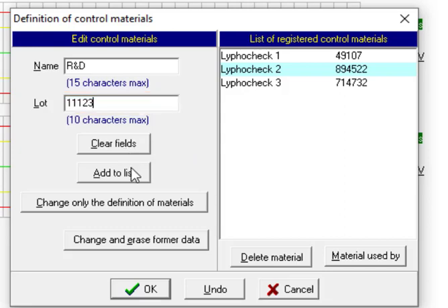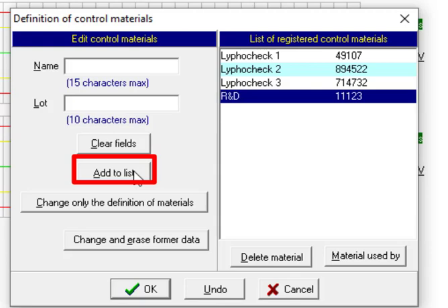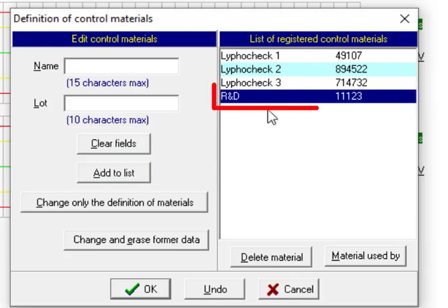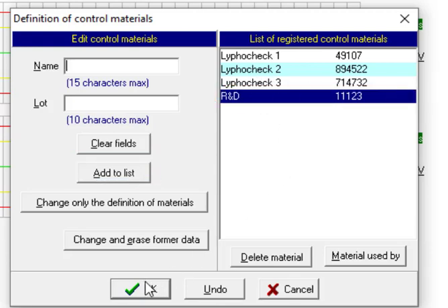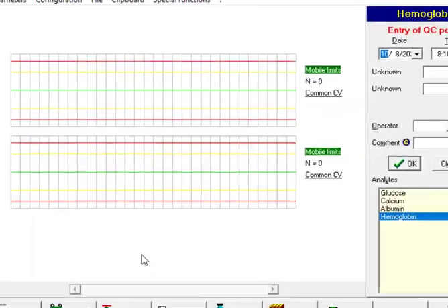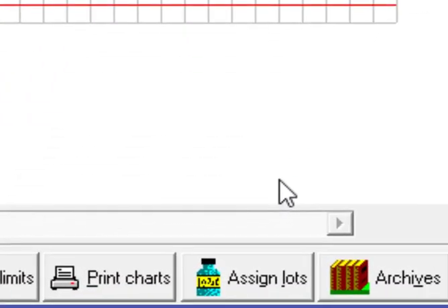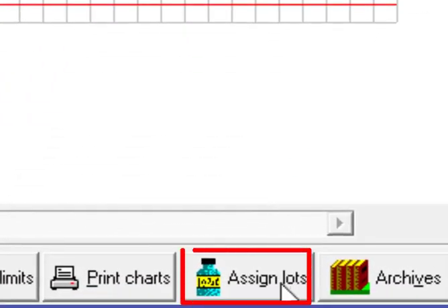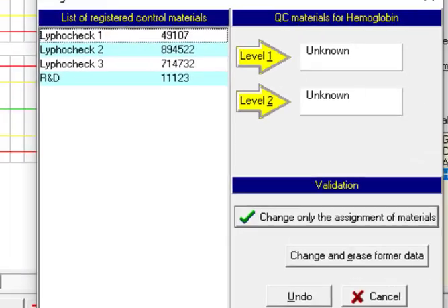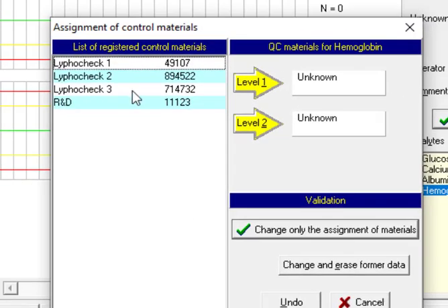So we press another time add to list and we define the control material. We press OK in order to be saved. And from here assign a lot. As I told before we have the control materials here. We need to assign.